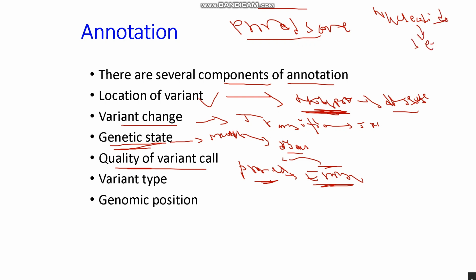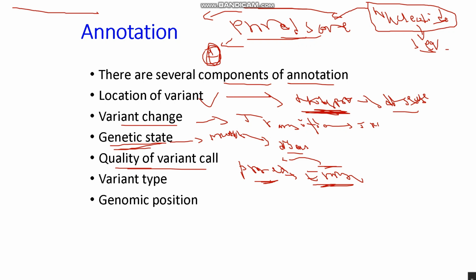If your question is about how the Phred score is given to a nucleotide, we compare the test sample or test sequence with the reference sequence, and by this we give the Phred scores, using the coverage.